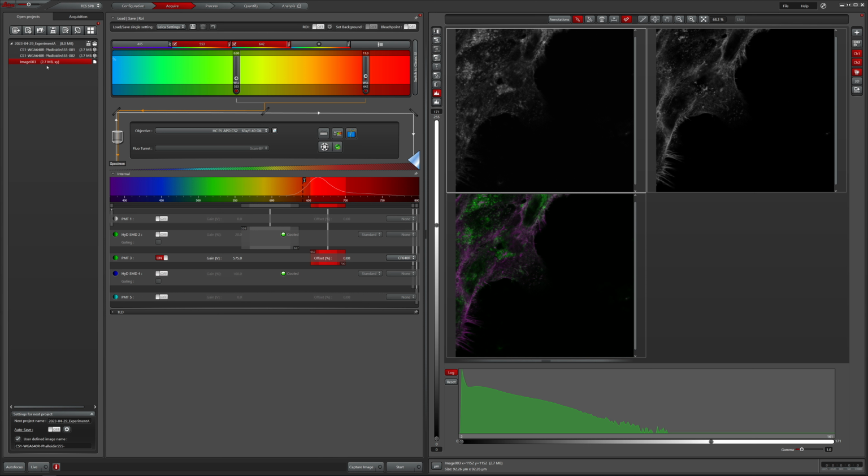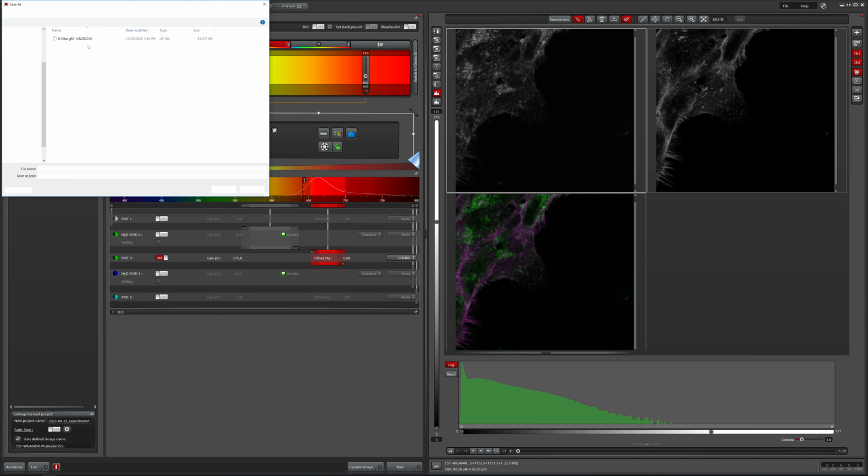Also, this is kind of useful if you're just testing things out, right? You can understand, oh, I see that this particular data set started with image. It's not interesting. So you can go ahead and delete that. This floppy disk icon means that it is not saved yet. So you're going to left click on this.